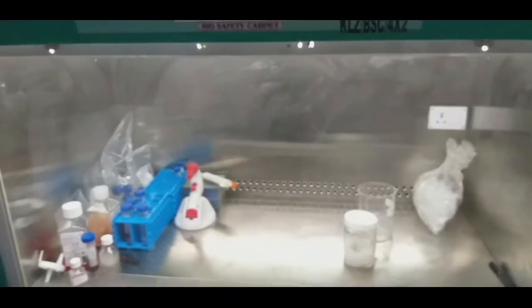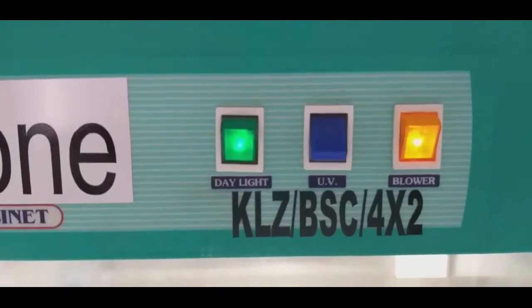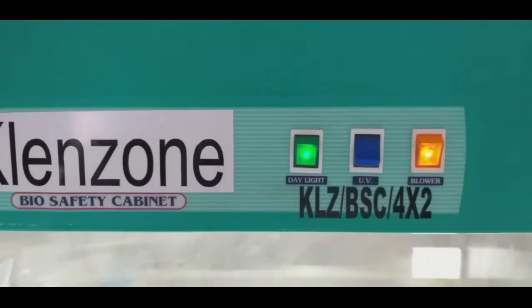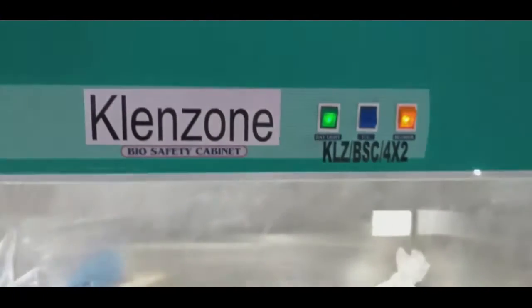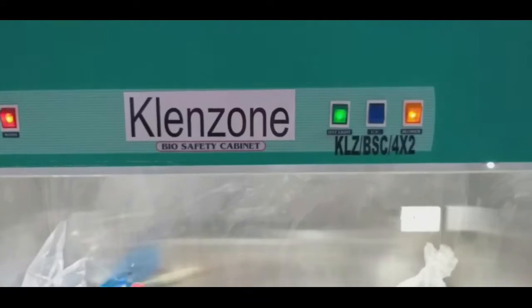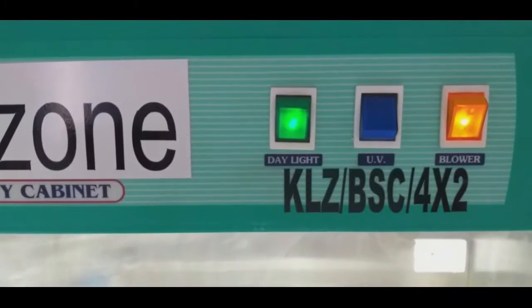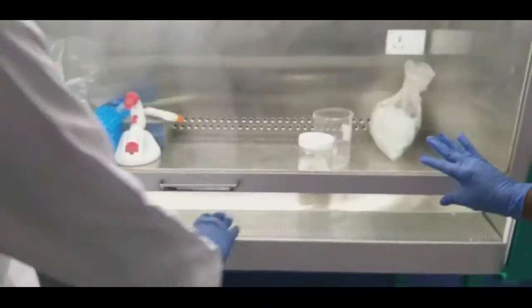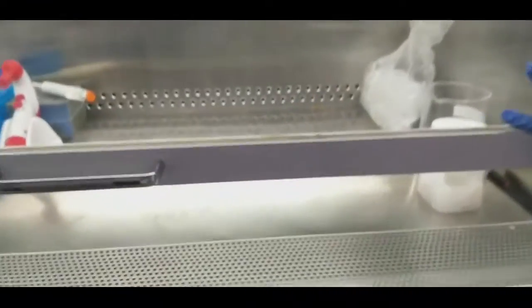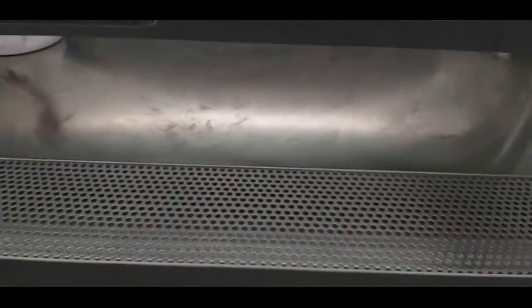Along with the pressure knob, there are other knobs on the Biosafety Cabinet. One is for daylight — a normal light for the working area. The second knob is for ultraviolet light, which is required for surface sterilization of the inside area. The third knob is for the blower, which switches on the compressor to provide sterile air with pressure inside the aseptic area. There is also a main switch which controls all three knobs. The inside part is made up of stainless steel.